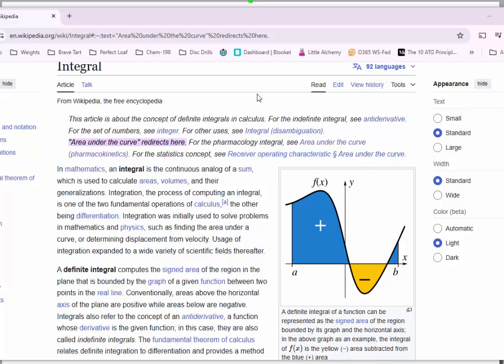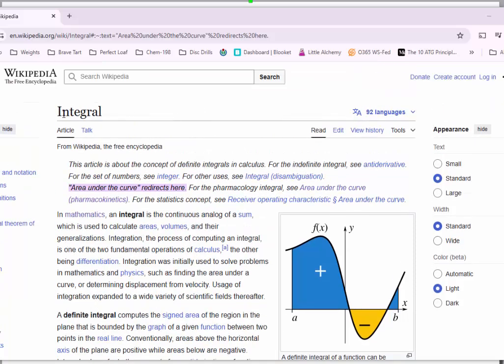But ultimately, if there's a single concept I want you to lock away right now, it is that an integral, for a chemist, refers to the area under a curve. That's why we care about integration. It is us using a tool from calculus 2 specifically at HWS, that allows us to extract valuable information.